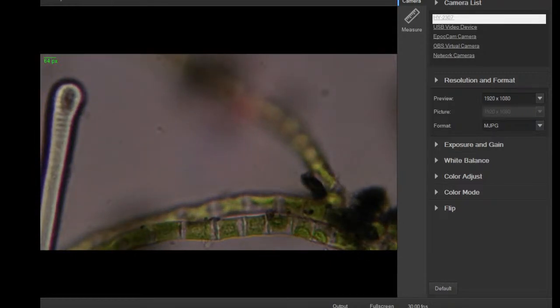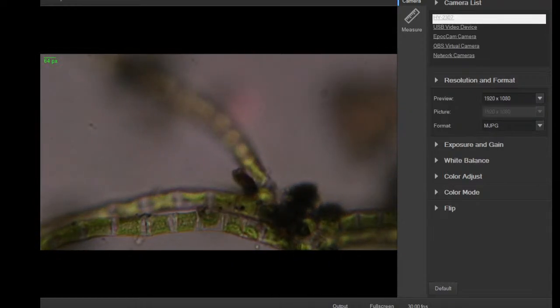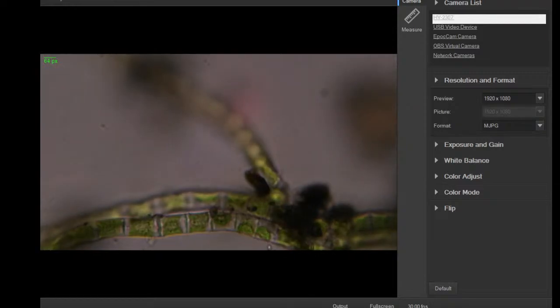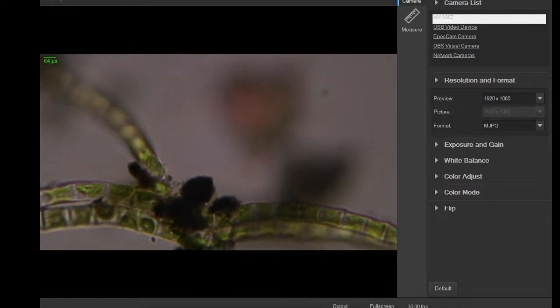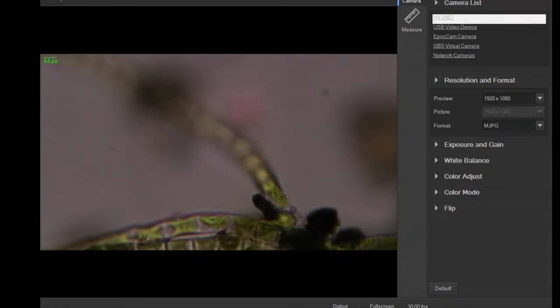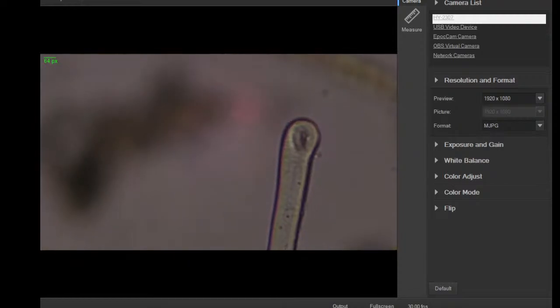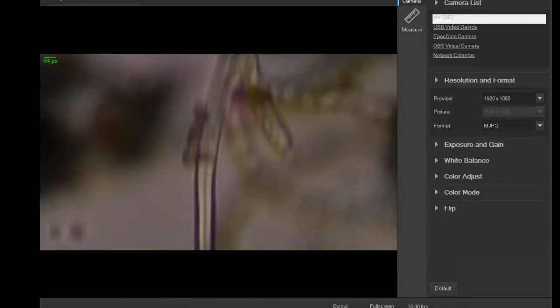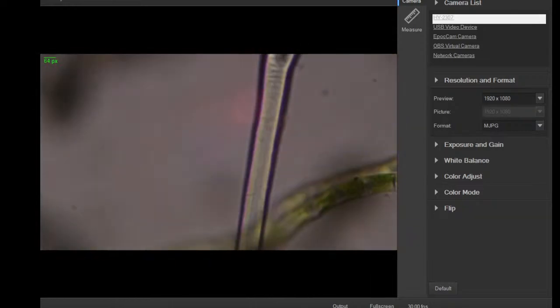Yeah, this looks like regular algae. I'm seeing little clusters of chloroplasts, and probably that might be the nucleus there. It's hard to tell from this view. And what's this little thing here? It's a fun shape. Looks like a needle.